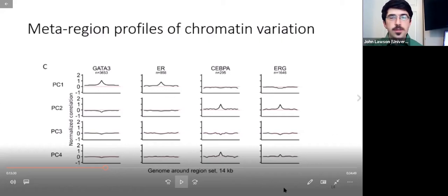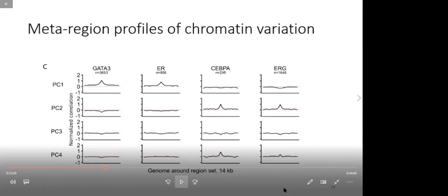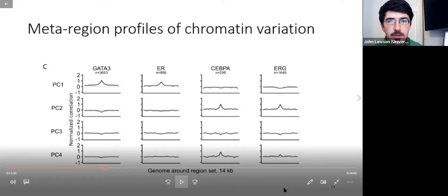All right, any other questions? Not that I can see. Oh, there's one more in the polls. Is there a way to identify epigenetic regulation using bulk RNA-seq if you don't have ATAC-seq data? There might be, but I think that's beyond the scope of what we're doing here. For this analysis, you have to have some kind of epigenetic data that has regions and signal there.